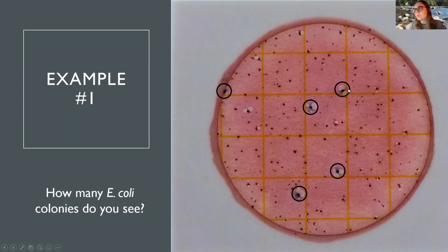It's like a blue smear almost, where the plate is designed to color those E. coli colonies. So when you see the smear, that's a good indication. We've done our best to update the photos and get as high resolution as possible with good lighting, but there's nothing like the real thing, as they say. So just keep that in mind as we're going through these.